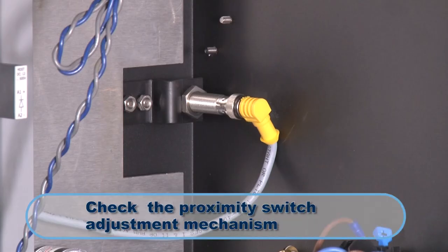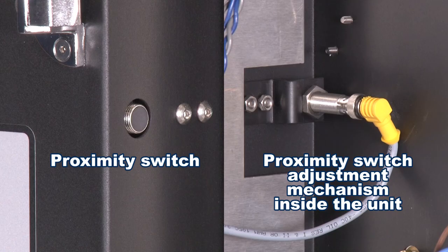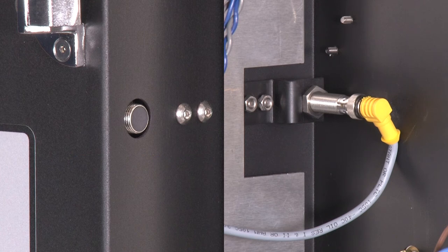With the side panel still off, check the proximity switch adjustment mechanism. The mechanism should be oriented to sense a closed door.